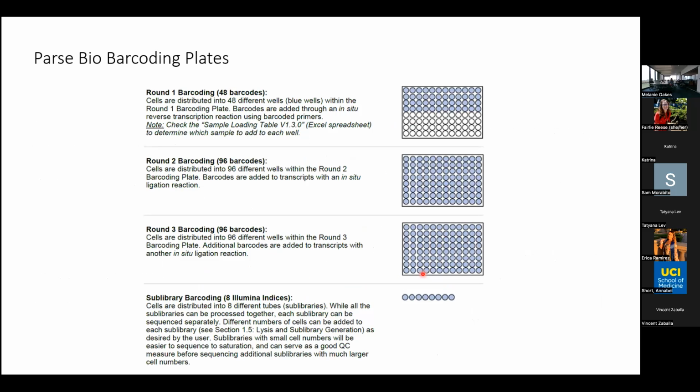So this kind of shows you. Wait, can I ask you a quick question here about the genomics high-throughput facility specifically? Do we just need to hand you guys the fixed cells? Yes. You do the rest? Yes, but please count. Okay. If you count them, then that's really helpful. No, that's excellent. No, that's good to know.